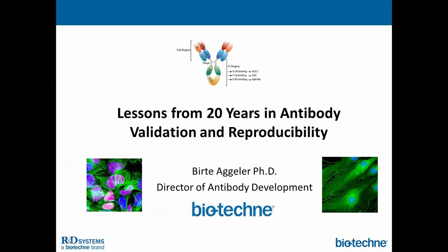We've done that test 5 times, 6 times over, and you can get that. So that's why it's crucial that you actually get the antibody titer into the correct range to make sure you're only recognizing phosphorylation. The other thing is you need to do the dephosphorylation in a lot of instances to show that your basal level detection without induction is the phosphorylated protein to begin with. If that doesn't change upon dephosphorylation, then I would abandon that particular antibody personally. Okay. Thank you. You're welcome.